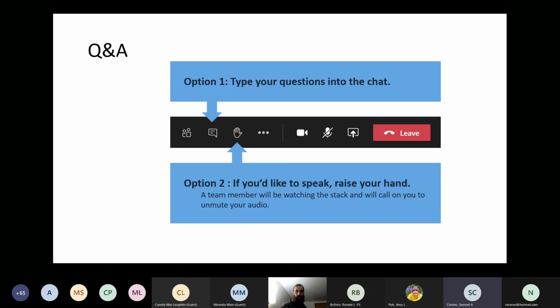Curious if you have had experience with the MinION and have thoughts on error rates from the MinION compared to MiSeq. Yeah, I have not personally used the MinION or any of the nanopore sequencing platforms. There is, I think it's still a preprint, Bastian Egeter and others recently used the MinION platform for amplicon sequencing, looking for invasive mussels. And I had a chance to talk to them some about their bioinformatic pipeline that they custom built to deal with errors. I can't personally speak to it.